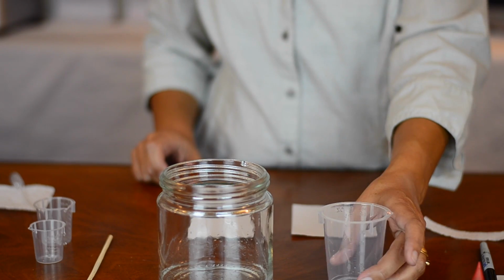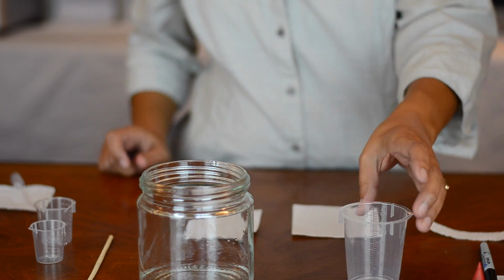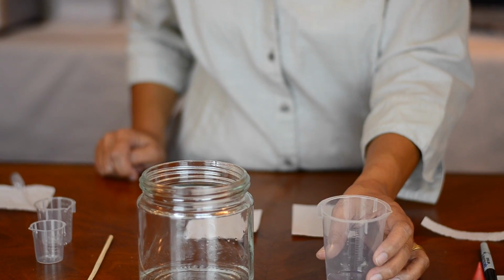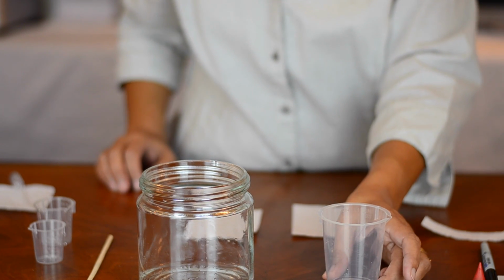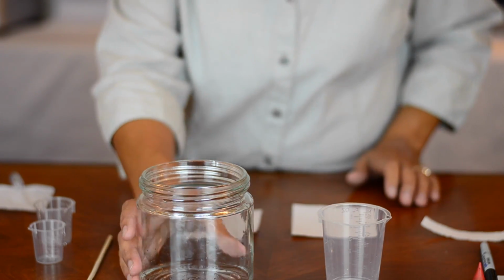our 150 ml beaker. I've already put a little bit of water at the bottom of each of these. You want to make sure that the water level is about 3 to 4 millimeters, and make sure that the water covers the entire bottom of the container. Some containers have a cupped bottom, and so you don't want to create a place in the center where there's no liquid. And the same thing with the jar.